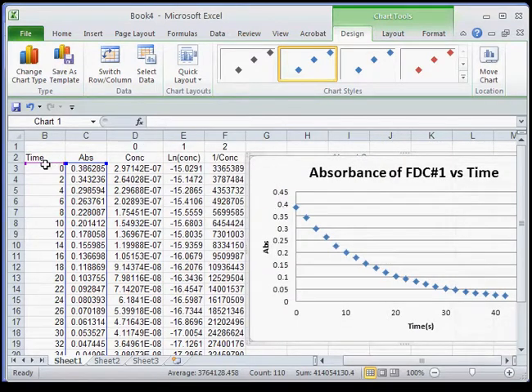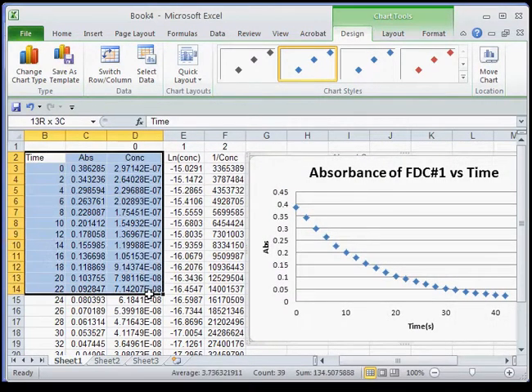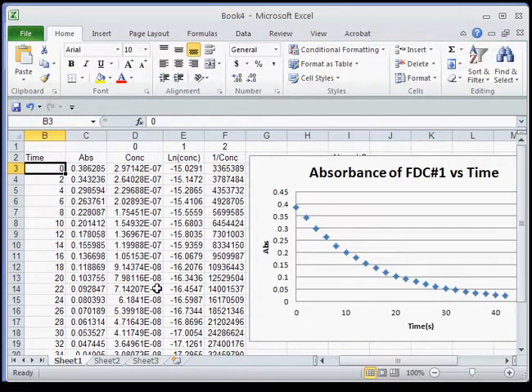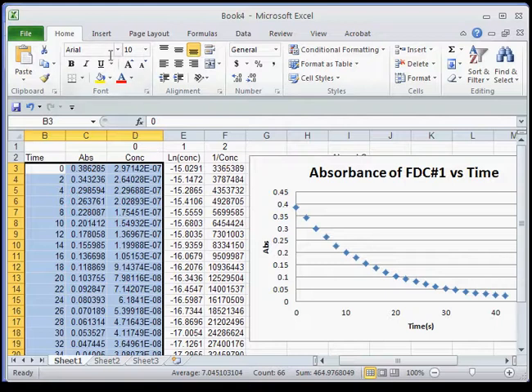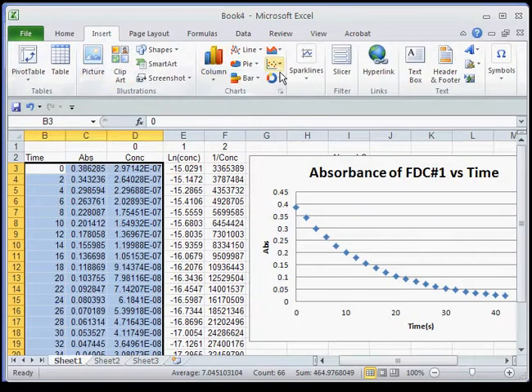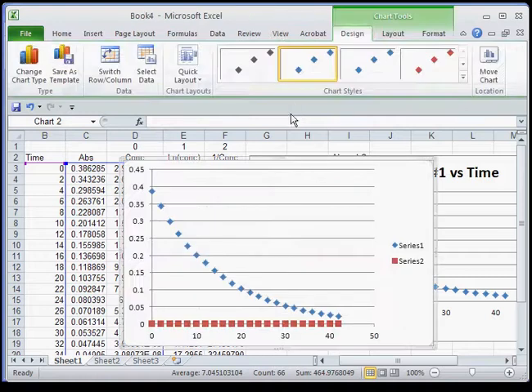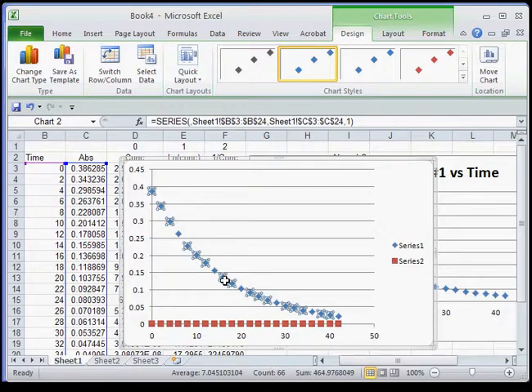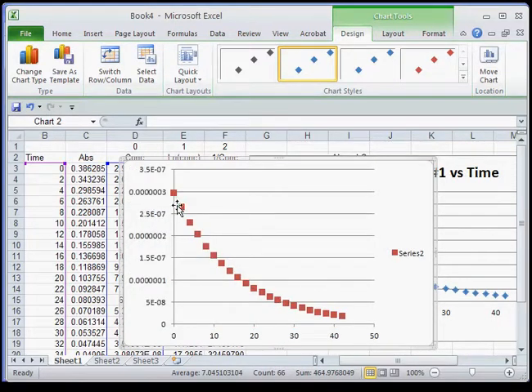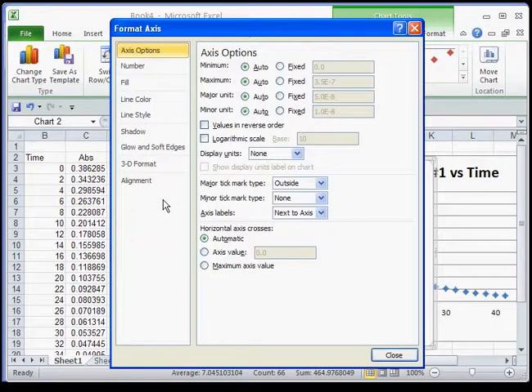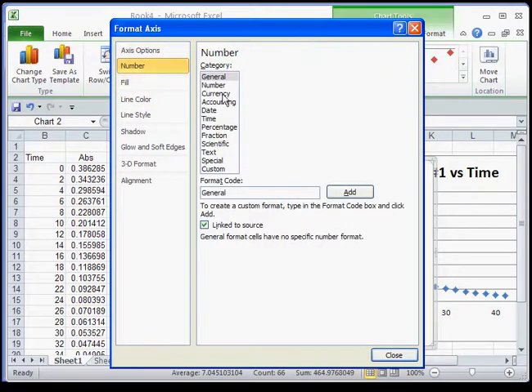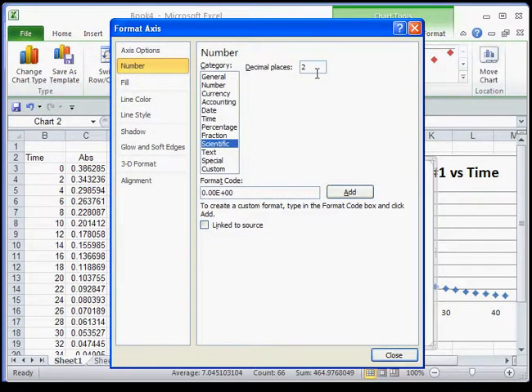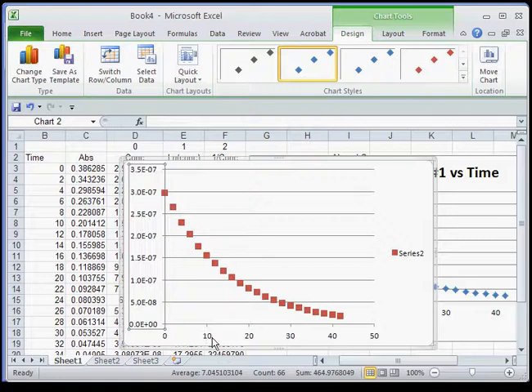Now I'll make the second graph. I select the relevant columns — including the headers so Excel picks them up automatically — go to Insert, and choose a scatter plot. I remove the unwanted series, leaving just the concentration data. The y-axis numbers look a bit unusual, so I'll double-click the axis and change the number format to scientific notation with one or two decimal places. That looks better.